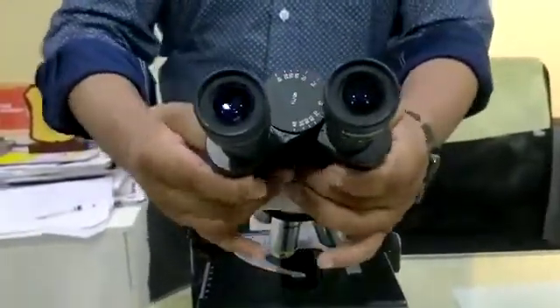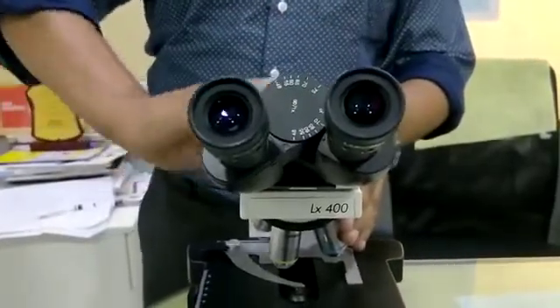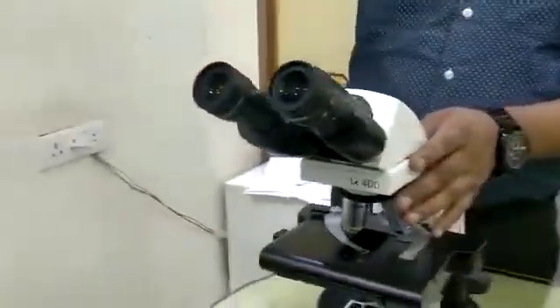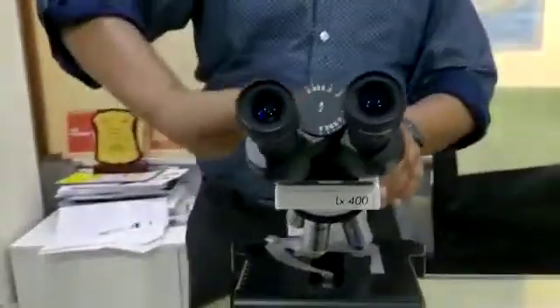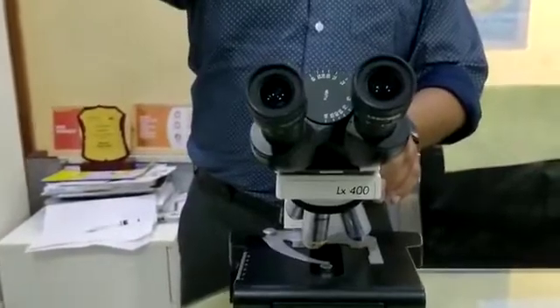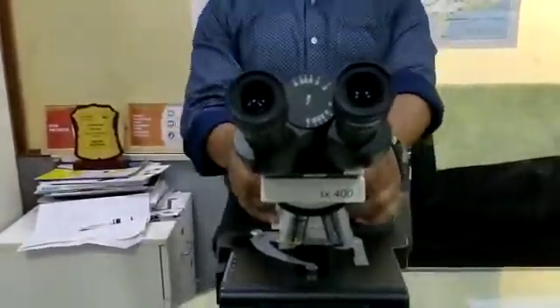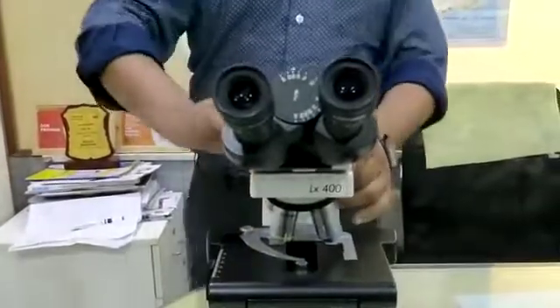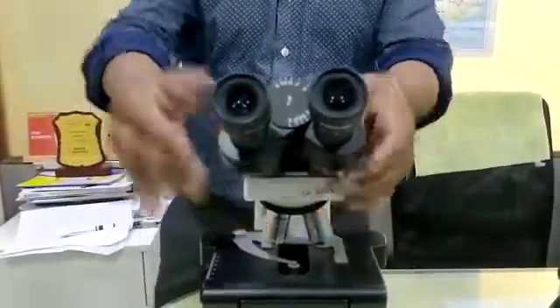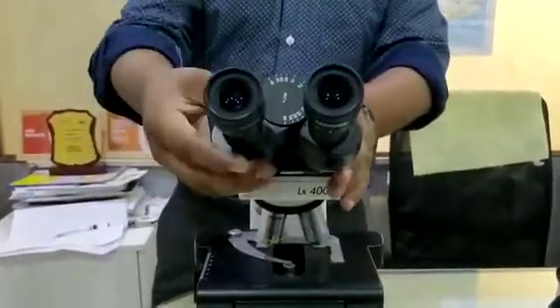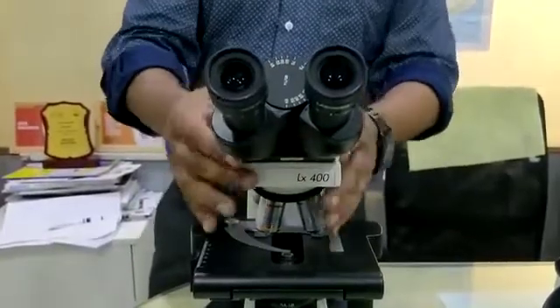Now talking about the angle, this has a 30-degree angle of inclination while other microscopes have a 45-degree angle. What is the difference? When using a 45-degree angle you have to sit with an erect position to see through the microscope. With a 30-degree angle, you can sit in a lean position also because the height is a little less, allowing you to work more comfortably.